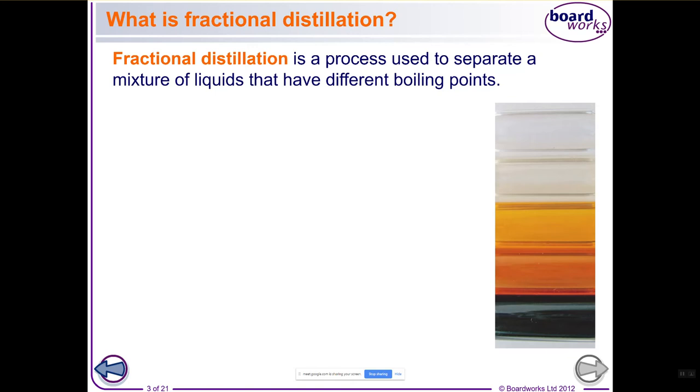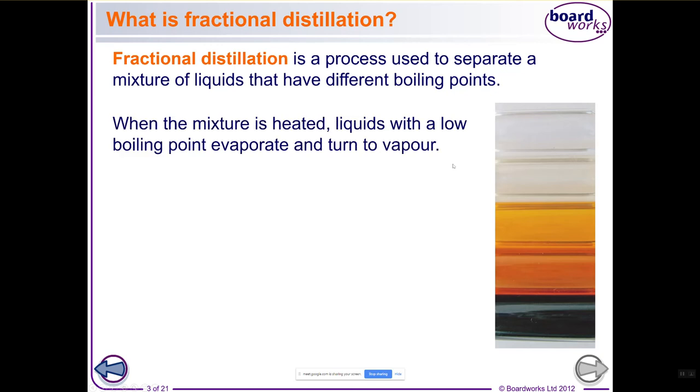So fractional distillation is just another separating technique, really. That's all it is. And it works when you have liquids which have different boiling points. Imagine you had a solution, and in that solution you had some treacle at the bottom here, and then you had some honey, and then some oil, and some water. So you have a big mixture of different liquids. And the nice thing is all those liquids will boil at a different temperature. That's basically what you need.